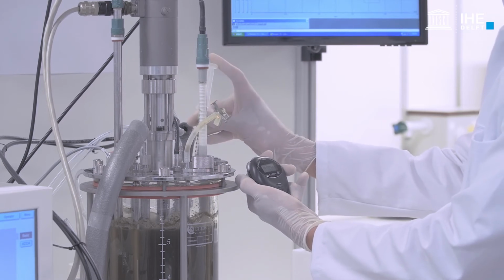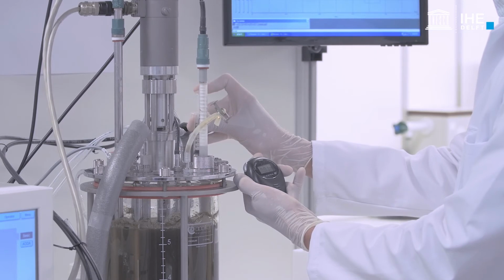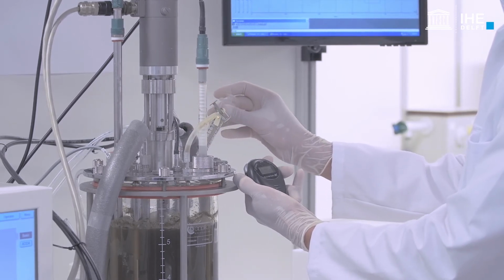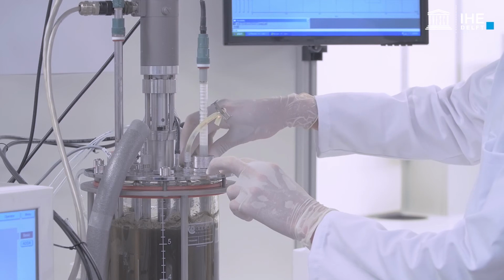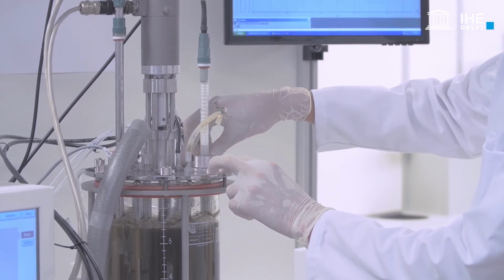Add the carbon source solution firmly and fast into the water phase. Simultaneously start the stopwatch. This will be the beginning of the aerobic batch activity test. Close the reactor.